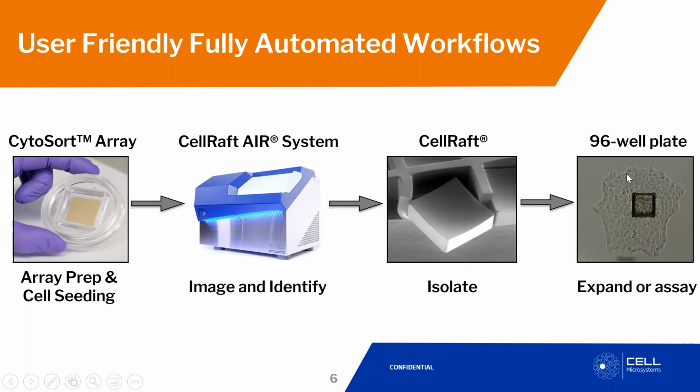And then off the array and off instrument, the cells can either continue to grow off of the raft, as shown here in a 96 well plate for clonal expansion, or you can assay them directly for lytic endpoints like sequencing or viability assays, if you will.